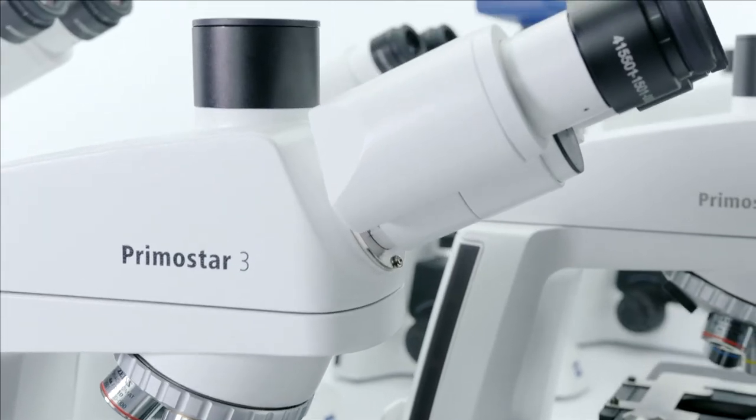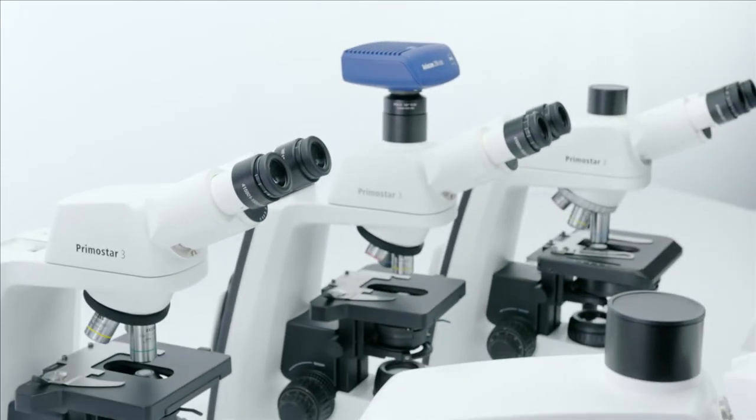That's where the Light Manager on PrimoStar 3 Full Color from Zeiss makes a big difference.